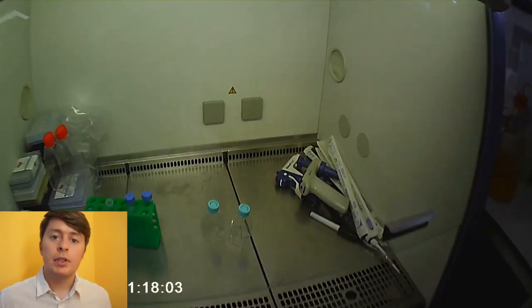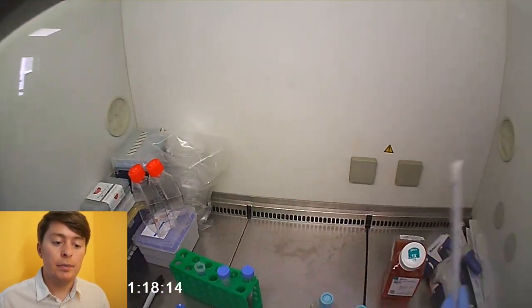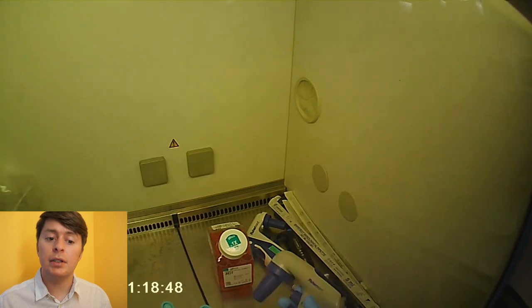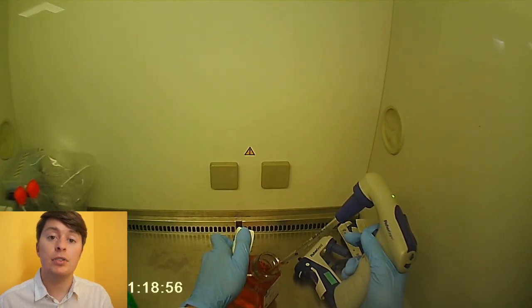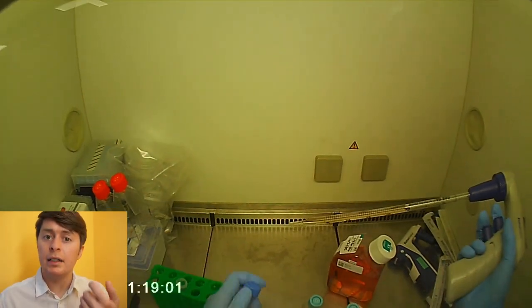try to plan ahead. So you'll see here, I've just put in the media. I've got my stripette. I open the media. Ideally, before you touch any stripettes and everything, you can loosen the lids on the cells and on the media. Again, only ever do that inside the cell culture hood. Never do it outside because you risk that contamination, as we mentioned. And doing it inside the hood should be fine. With the lid ever so slightly loose, that just means it's a bit easier to handle when, as you can see now, I'm holding it in my hand, I can just simply unscrew it. And I'm not struggling to grip it with one hand and undo that lid.